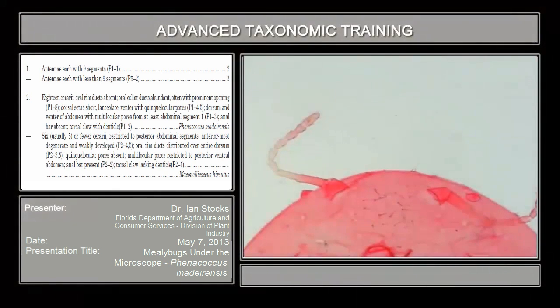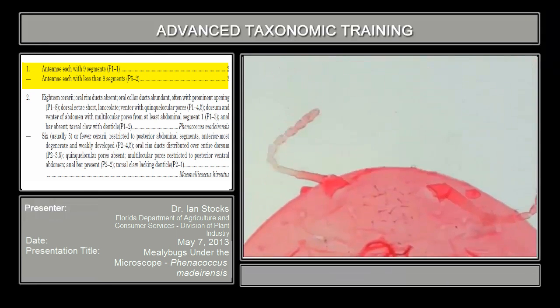Okay, so does everyone have a Phenacoccus madeirensis mounted? And we're on the low magnification, 4x. Okay, so you get the orientation, anterior to posterior.